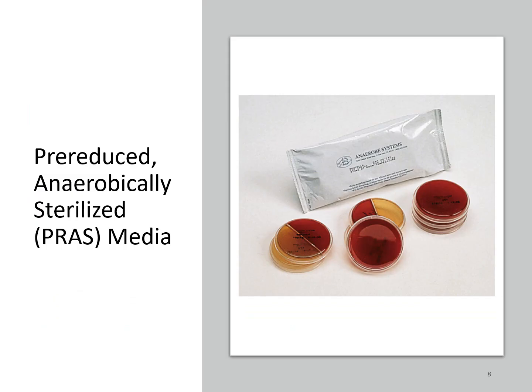There are some commercial systems available for anaerobic culture media, and so something like this would be where you actually get the culture plates pre-packaged. So they're actually produced, packaged, and shipped and stored under anaerobic conditions, so they're sealed in those little pouches to keep that agar plate in an anaerobic environment. And then once you're ready to set up that culture, you would actually take those plates out of that packaging, set it up, and then return it back to an anaerobic environment.